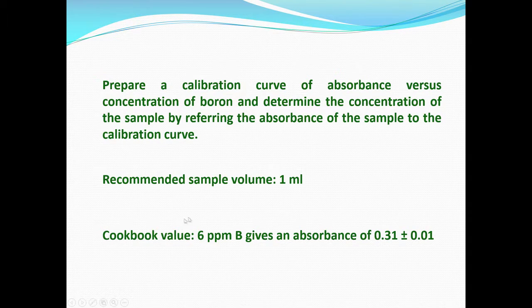And to do this, you need to prepare yourself for high quality laboratory work using milliliter or microliter pipettes. And if you continue doing the experiment, if you get 6 ppm, 0.31 absorbance, all is well. That is the speciality of the cookbook value.